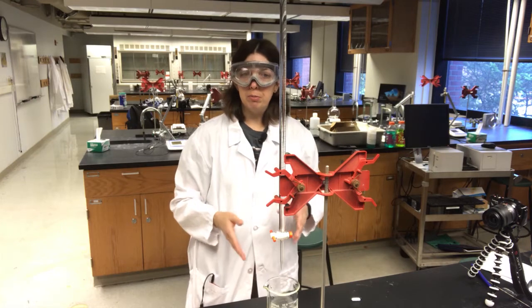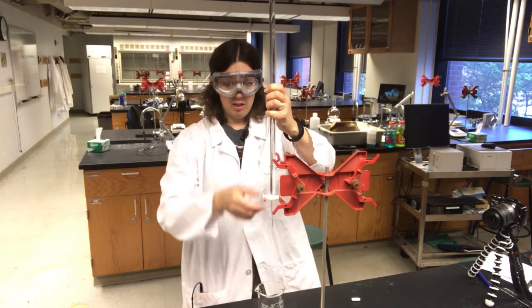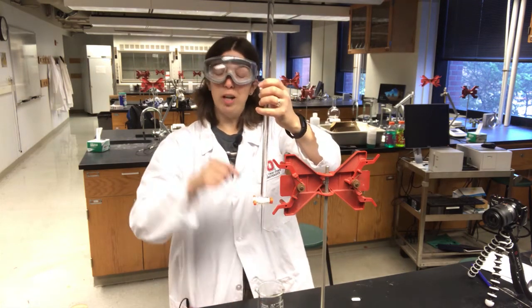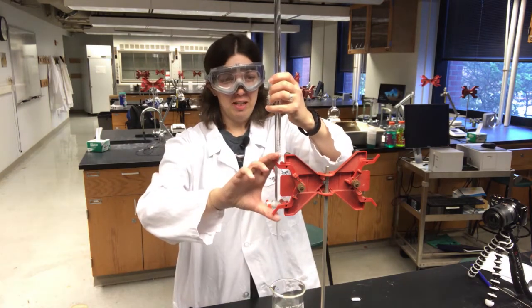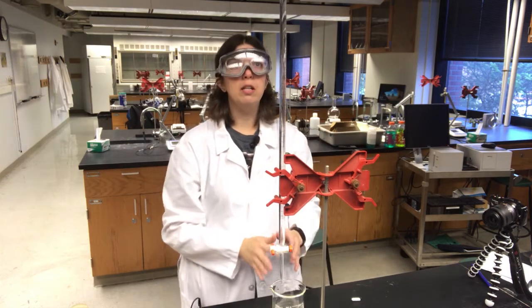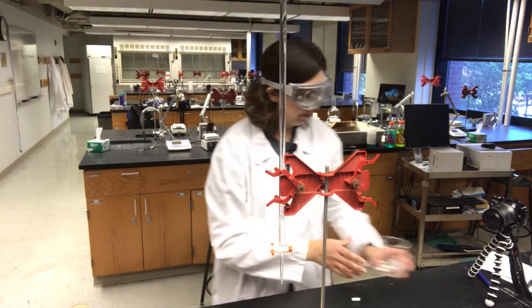If you still have a bubble and can't get it out, take the burette over a sink, open the stopcock, and give it a really hard shake — but be careful not to jam the burette into the bottom of the sink, as that's a great way of breaking it. Now this looks good and the burette is filled.